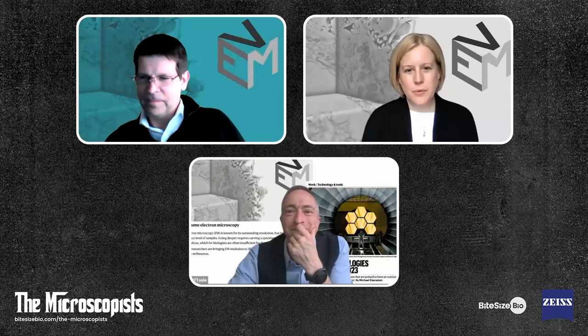For the last few years, we've called what's happening a quiet revolution because it's been a bit under the radar with the Nobel Prizes in super resolution light microscopy and in cryo electron microscopy. But I think we can say it's arrived now.